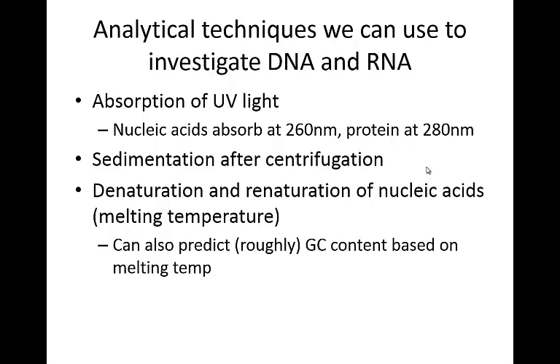You can also take advantage of the fact that DNA can be sedimented after centrifugation. So all of these different nucleic acids, proteins, other parts of a cell, the mitochondria, the nucleus, all these things, they all have a different weight to them. So if you perform centrifugation, you can specifically isolate whatever you want to study.